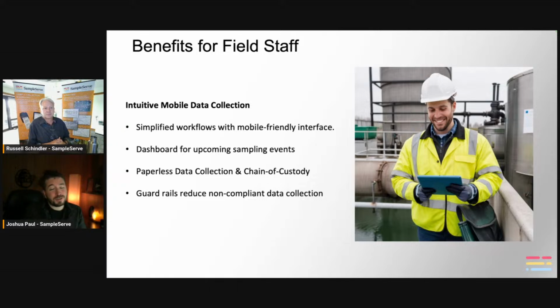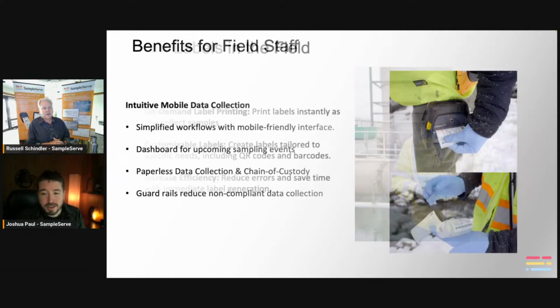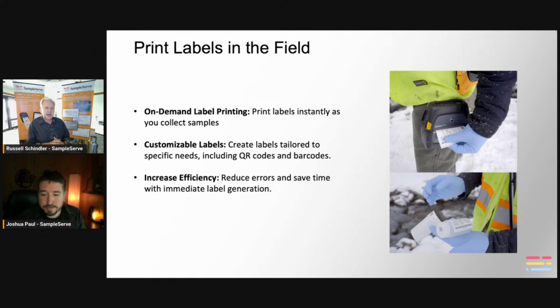One of the things they also like is it generates your chain of custody for you automatically. It knows all the data, it creates a chain of custody for you. These chain of custodies can be customized, and they can also go out and share that chain of custody with whoever they need immediately, digitally. And it works really nice with the lab app as well, which we'll show you later. Yeah, it saves the field techs a bunch of time, which they obviously like as well.